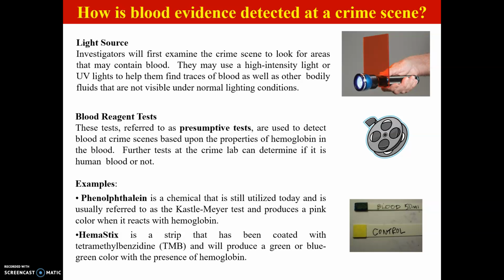Now, most of us use the original kits, which one of the videos you have is going to show you how to use a TMB kit. The company that created this hemostick with a strip, there have been known to be a few too many false positives. So a lot of forensic science departments use the old school TMB kit as opposed to the new school hemostick kit.